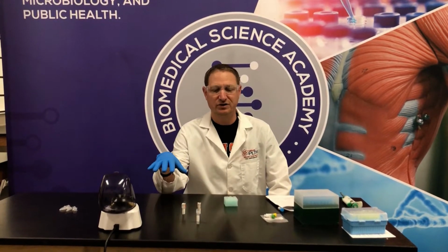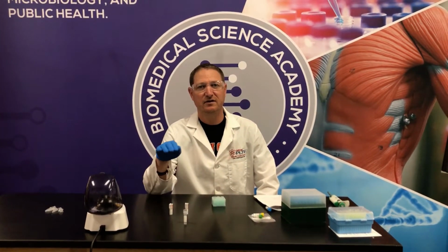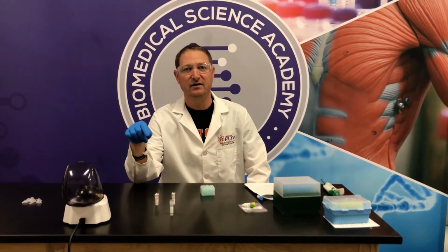Hello everyone, we're going to take you through 131 DNA Detectives. This is the mini 1 version, and we're going to show you the teacher setup. We're going to walk you through the student actually doing the lab and then reading the results.